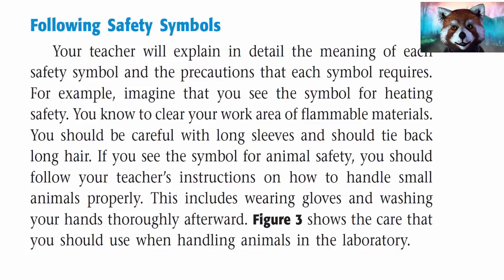Following safety symbols. Your teacher will explain in detail the meaning of each safety symbol and the precautions that each symbol requires. For example, imagine that you see the symbol for heating safety. You know to clear your work area of flammable materials. You should be careful with long sleeves and should tie back long hair.